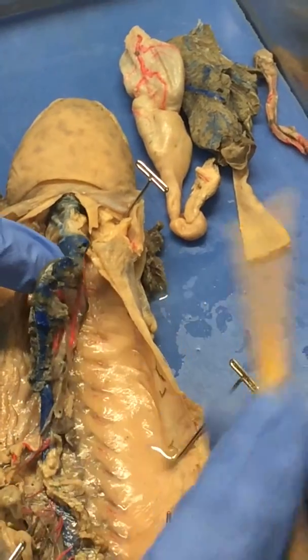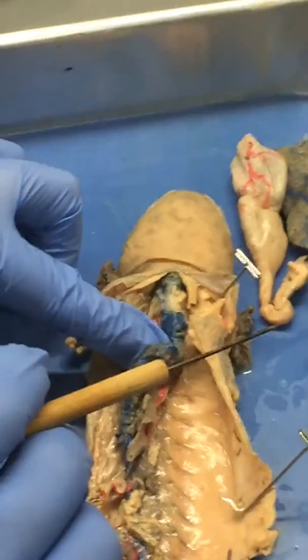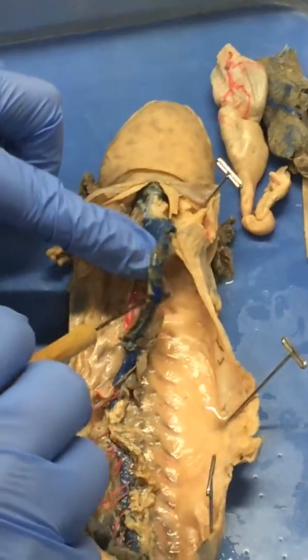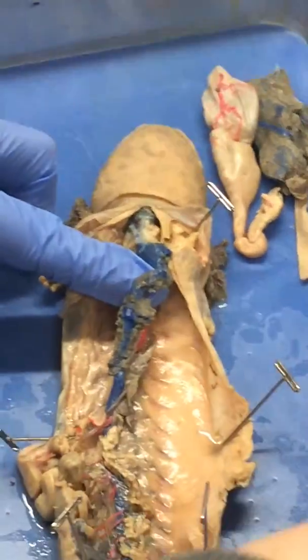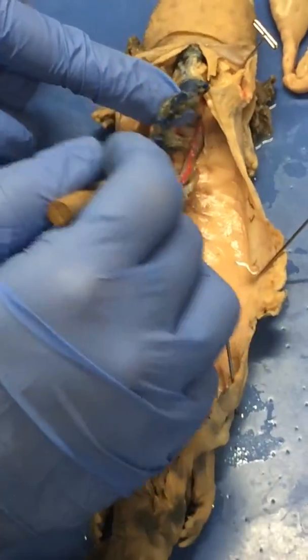This is your vena cava. So this is your vena cava — we did a little review on this too. That's your vena cava, the posterior vena cava. It goes all the way down.